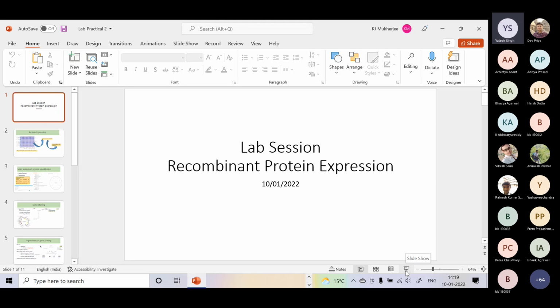Your cloning of a single gene can be considered a project. Unlike the older days, we now first make a project in silico using computer and softwares. We verify it, run the in silico gels, and see what the probable fragments can be. We do the whole thing in silico first, and then we start the hand session.